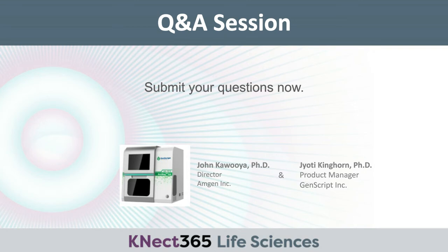Great, thank you, both of you. Another question, what's the typical elute concentration after a mag prep? Is it necessary for further concentrating the samples? Jyoti, do you want to answer, or I can, based on your experience there? You can go ahead, John.